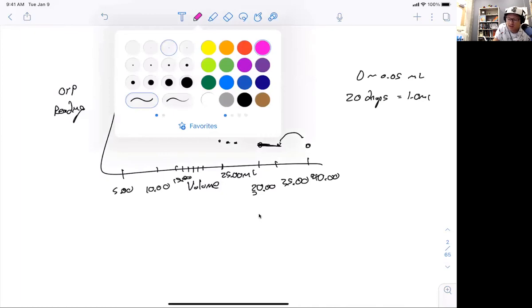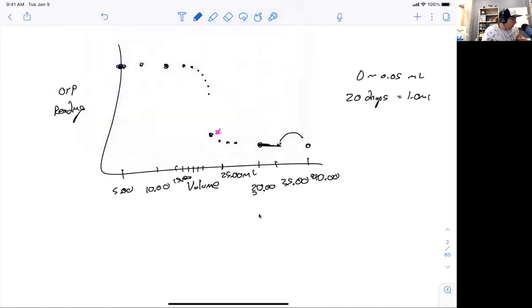But your second one, now you have a really good idea, because in your second one you've added exactly 25 mils with the pipette into the second beaker. So now you're going to go through and hopefully get a much better equivalence point. Again, we're not going to expect the equivalence point in the first 15. So maybe you go 5, 10, 15.